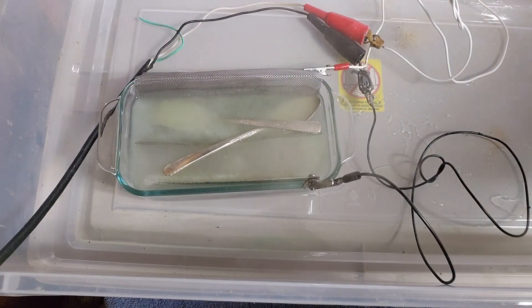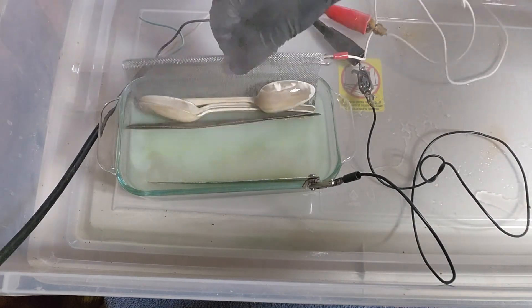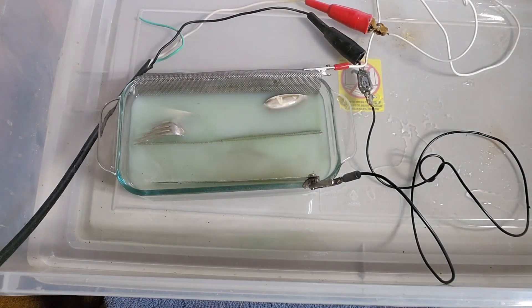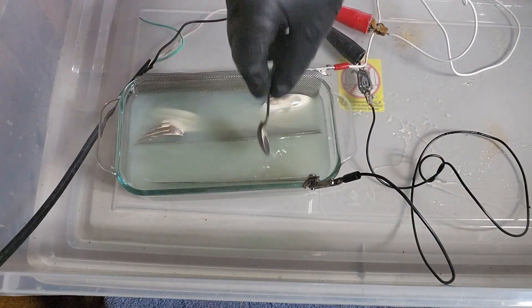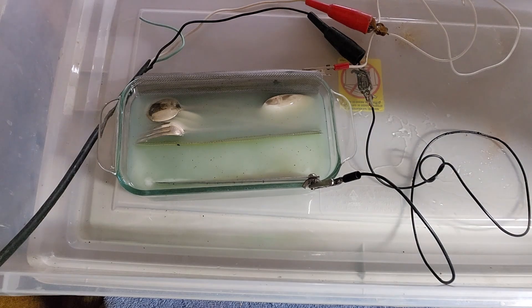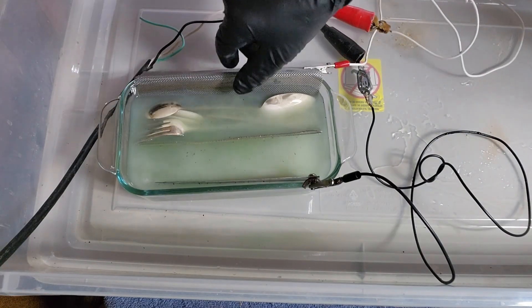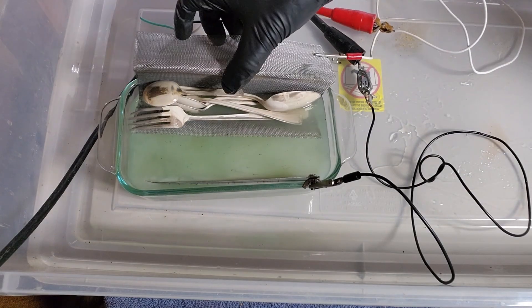What you're seeing right here is my testing tank. I do a lot of reverse plating in both silver and gold, and this was for a long time my primary means of reverse plating these metals. It's far too small today but it still makes a great test tank. I've been out of refining for about 10 years and I'm just now getting back in. When I came back, I knew I had some definitive changes I wanted to make.